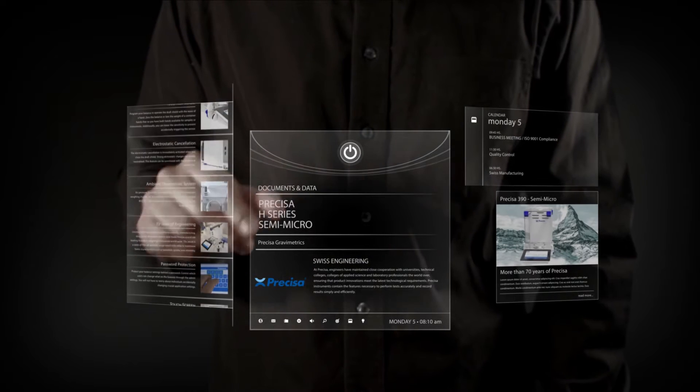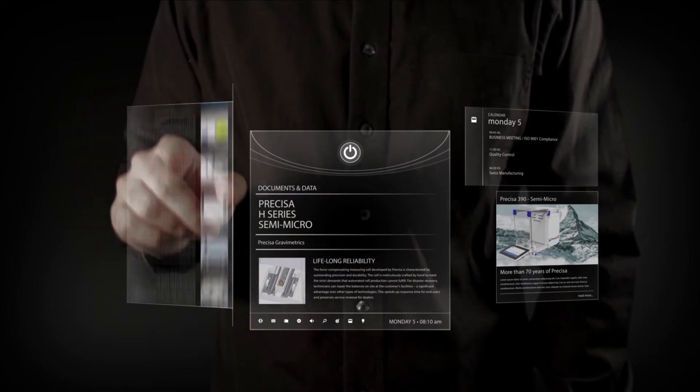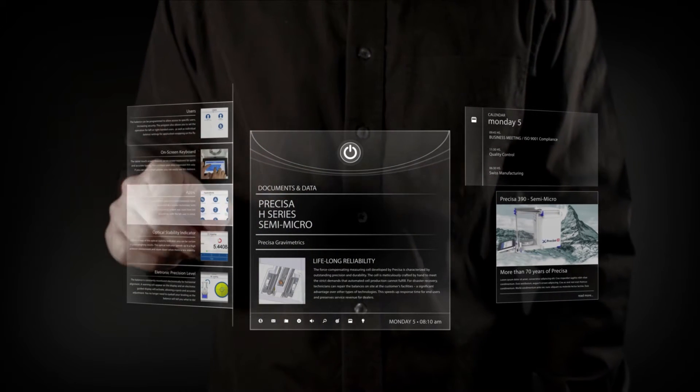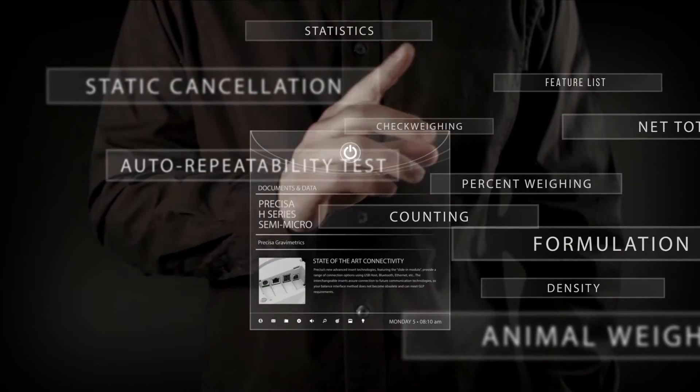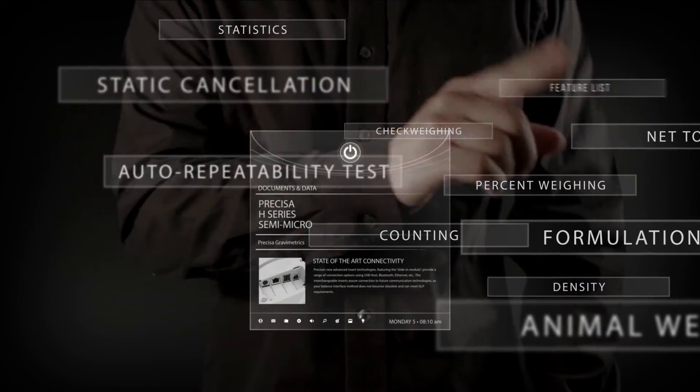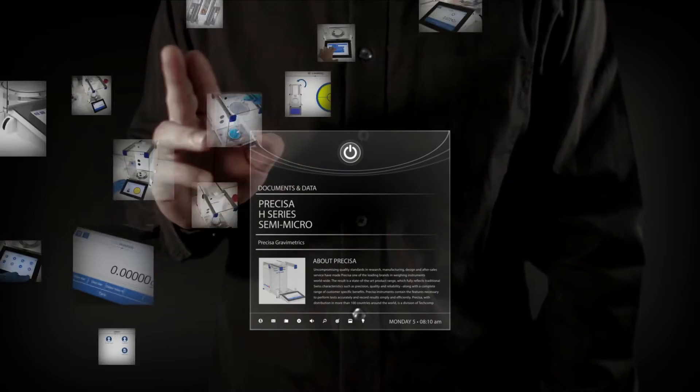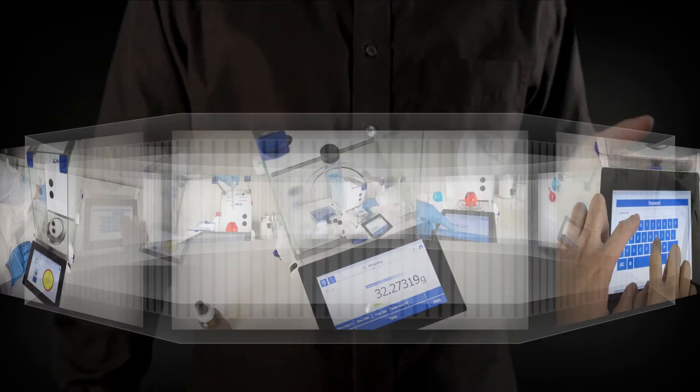It all started with an idea. What if we took our powerful and sensitive ultra weighing system and approached it with the familiarity and intuitiveness of modern touchscreen devices? What if we designed a balance where every feature and application was as easy to access as applications on your smartphone?